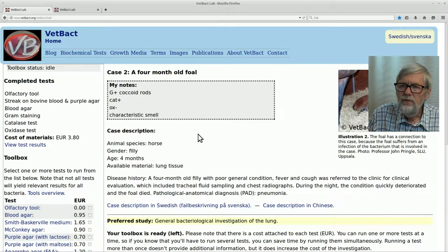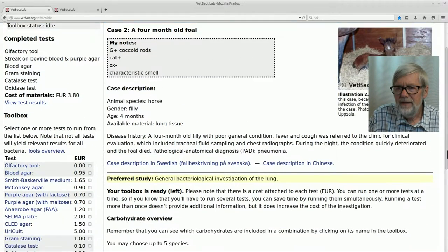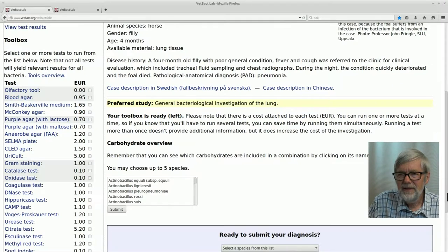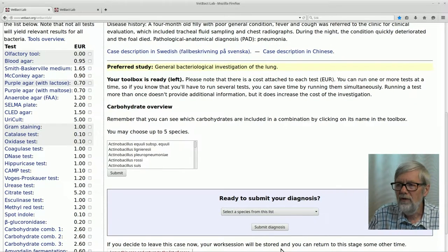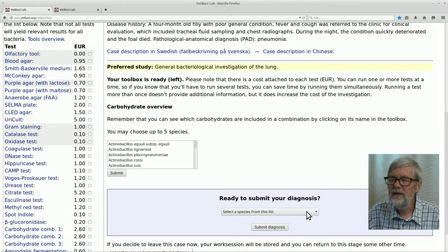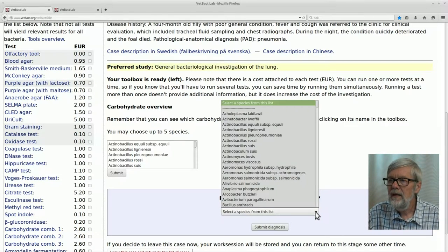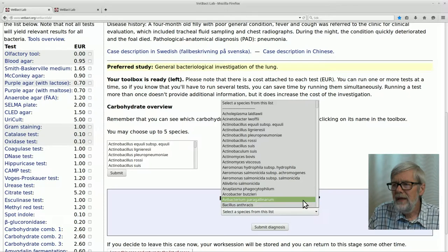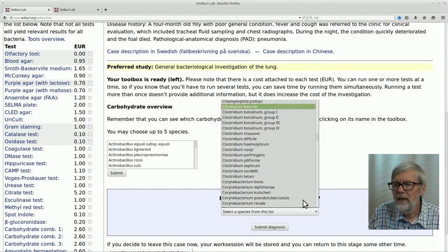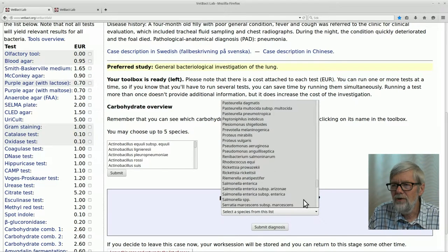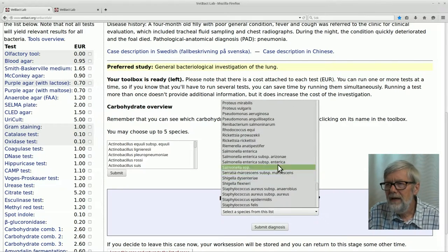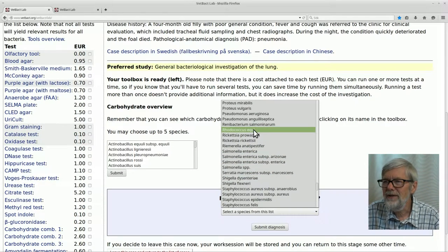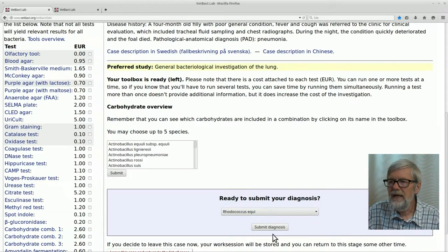Maybe you already suspect what bacteria this could be, but probably it is still a guess. I think it could be worthwhile to make a guess already now. You select the correct species from the list of all bacteria in VetPact. Since it is a foal and given the result of gram staining, you may suspect that this could be Rhodococcus equi. Let's select Rhodococcus equi — I'm not absolutely sure, it could perhaps be something else — but let's take a chance and submit the diagnosis.